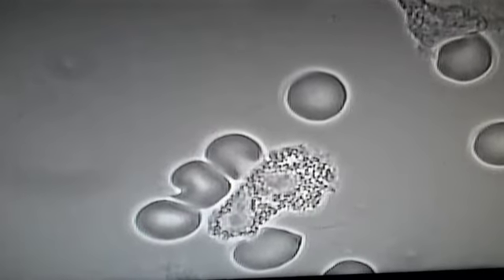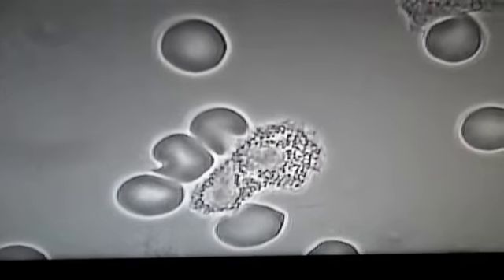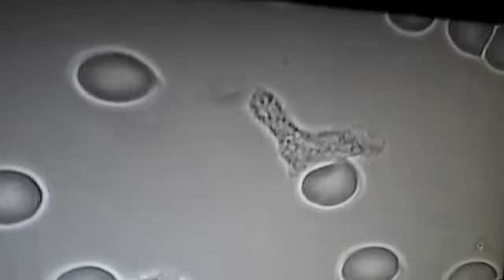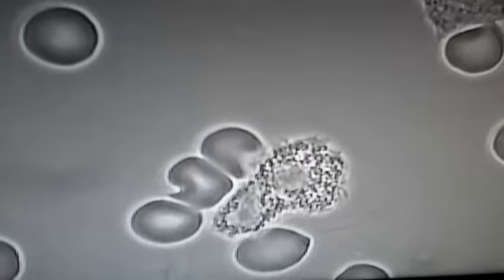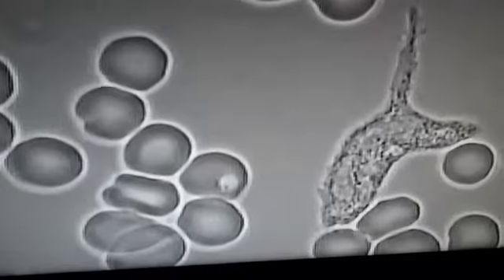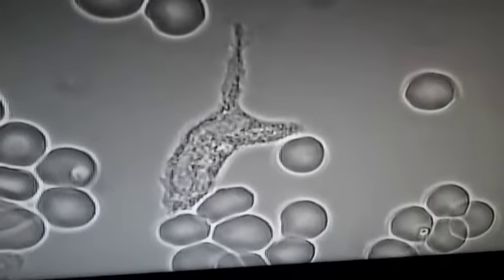Here we have the blood. We've got much more active white blood cells streaming nicely, not sluggish like last time. Lots of healthy red blood cells and no sign of the blood cells having been attacked by bacteria. Look at that white blood cell — it's absolutely marvellous.